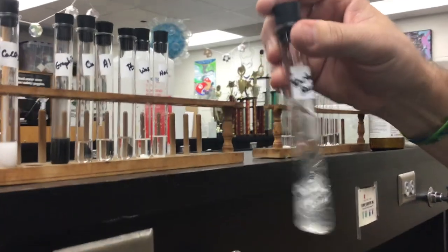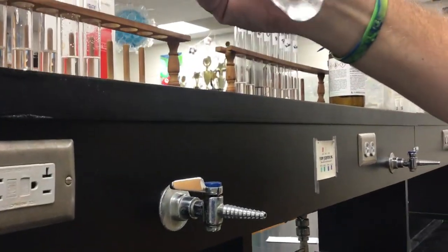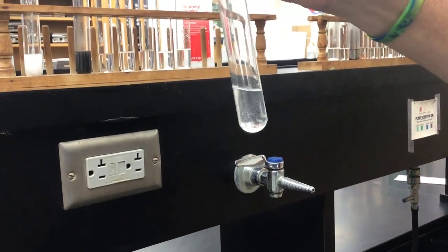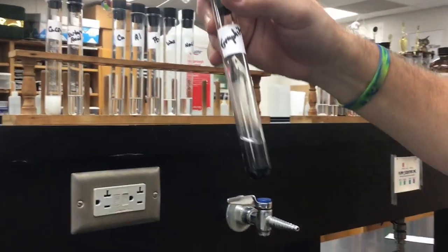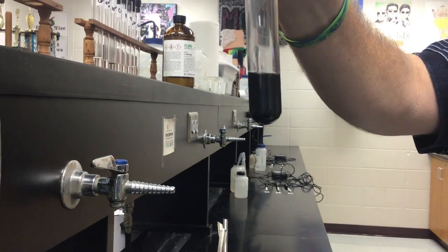And then same with the tartaric acid. If you look at the tartaric acid, see maybe a little bit in there, but quite a bit of it is, it's a lot less than what we started with. So anyway, all right. And then we'll also look at the graphite here, kind of cloudy. Say whether or not that's dissolving in there.